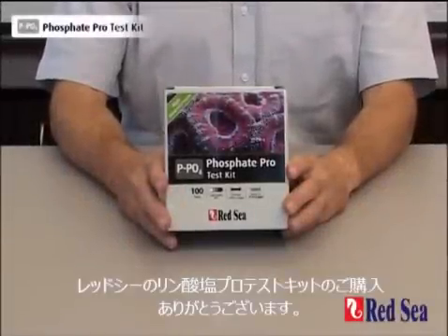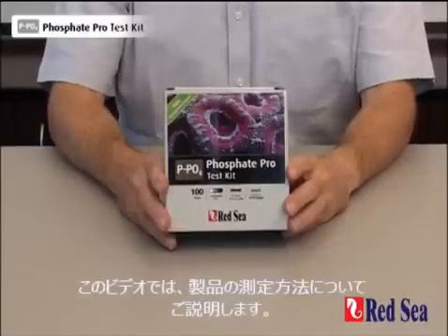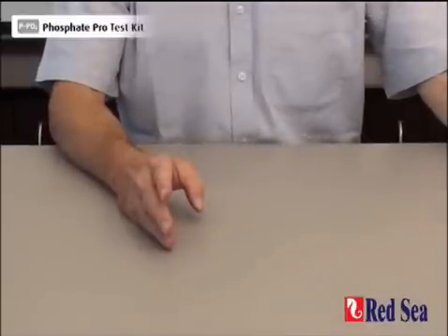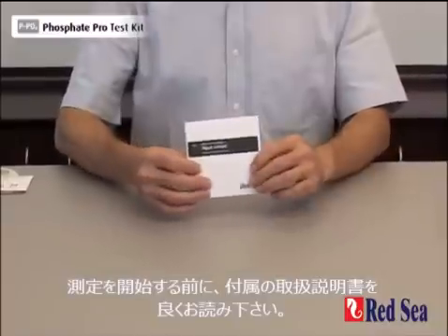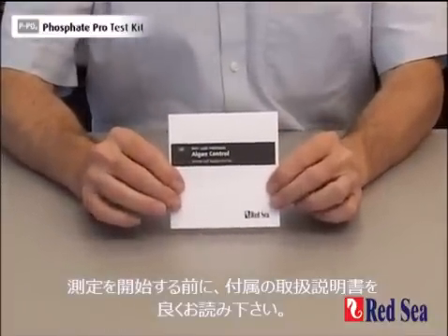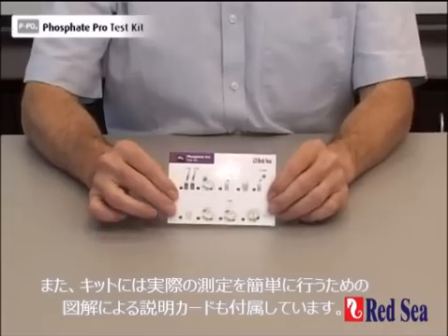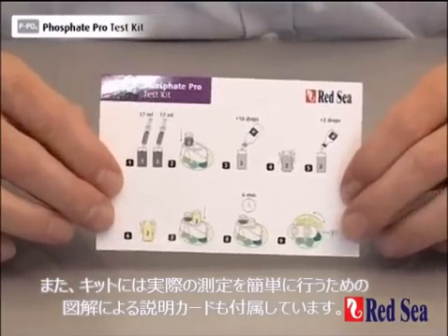Thank you for purchasing Red Sea's Phosphate Pro test kit. The purpose of this video is to demonstrate how the test is performed. Before performing the test for the first time, look for the instructions in the manual provided with the kit. We also provide an easy to follow set of graphic instructions when you're actually performing the test.